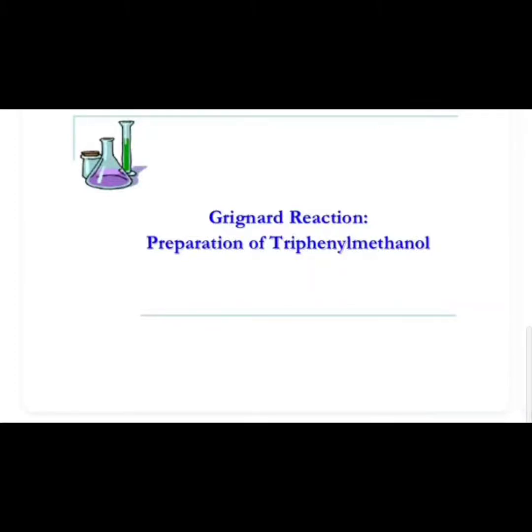So to all of you, today we are going to discuss the Grignard reaction. We will only discuss the preparation of triphenyl methanol. So how can you prepare triphenyl methanol easily in the lab?